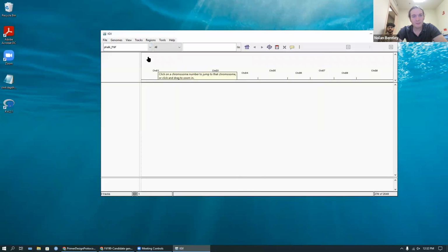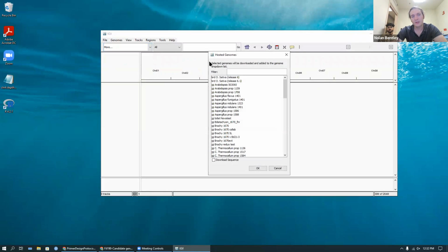Now, one thing that you may have needed to do if you've never logged into that server before, once you've got everything set up, this is me parsing JGI's multiple IGV servers. That's what those settings were doing. It was allowing me to tap into the list of available files. So I would have scrolled down. We're one of the newest data sets, so we were at the bottom. I guess they fixed that. Yeah, there we are.